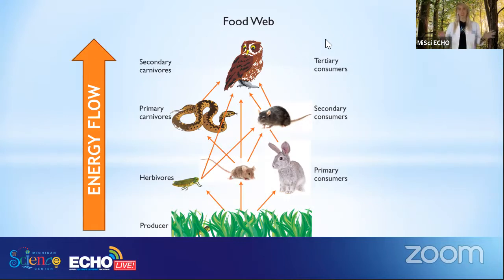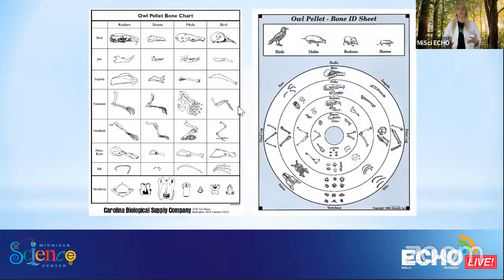So you guys have really impressed me with your food web knowledge and your knowledge of life science. And so let's get into the dissection today. We said that we are dissecting owl pellets. And what's super fun about these dissections is that we'll get to do some bone identification, which I said can be pretty similar to the study of paleontology or the study of fossils.